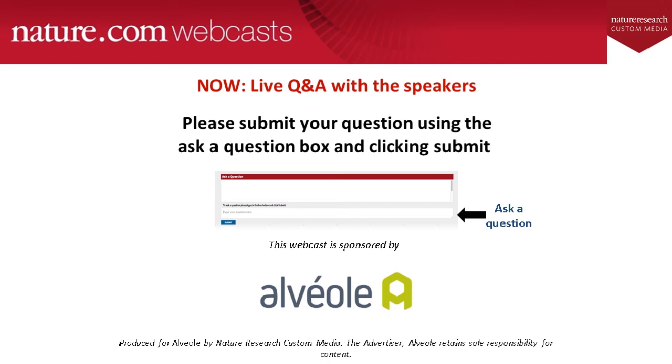We've also seen a paper which used silicon dioxide holey films on gold. And then I didn't go into the grid type in that early paper that we mentioned where they did combine cryo-ET with grid micropatterning using microcontact printing, but it was actually quite different from the ones that we use. And so I would expect the process to be compatible with different materials. You may need to change certain parameters, such as the time in plasma. So for silicon dioxide, I might actually go a bit higher than 10 seconds, although I haven't tried it.